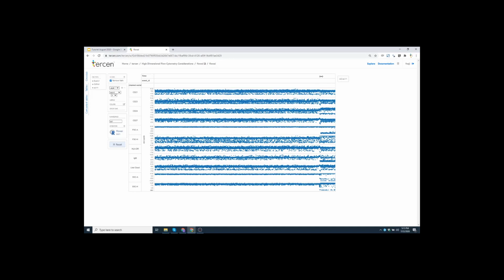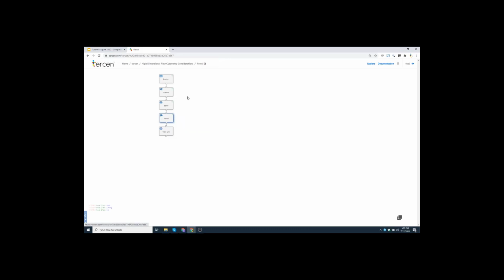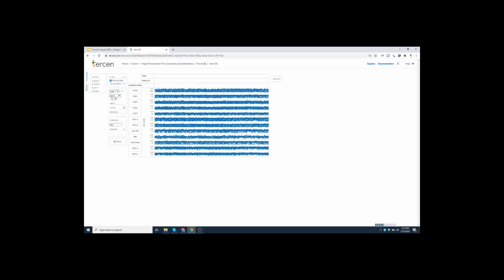And you see at the end here, you clearly see some surge effects happening, and a little plateau effect. So Flow AI is the operator, and it's being applied to this projection where you have observations as the columns and variables, or channels, as the rows. So it's been executed already. It's green here, and you can look at the output. And the output is cleaned up.